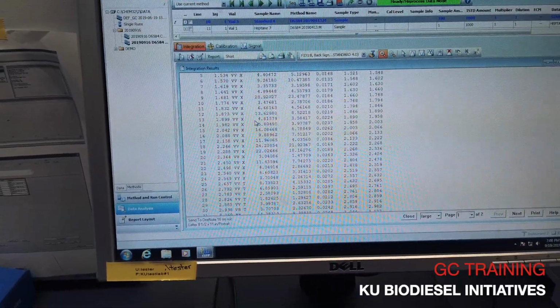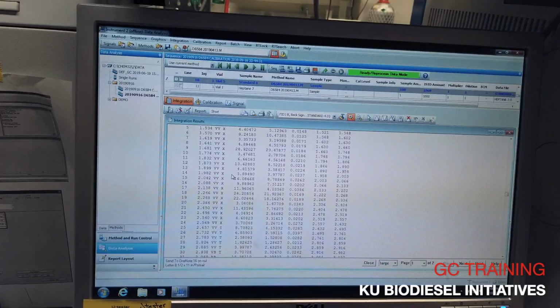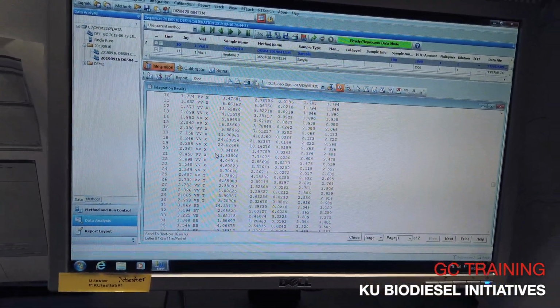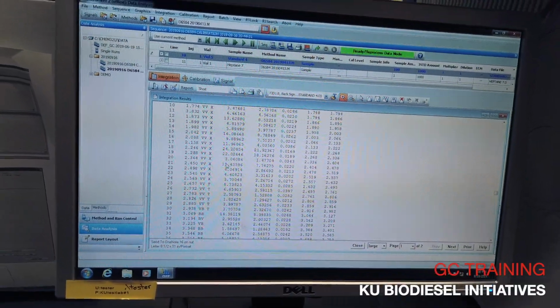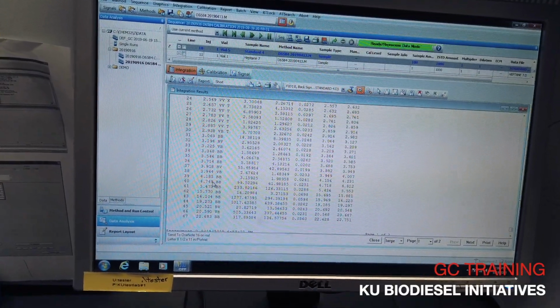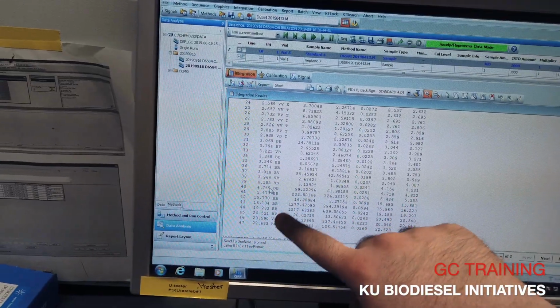So I kind of realized that this might be a lot to do in one sitting. So we might need to split this up. But I'll let you all dictate how, when you hit a saturation point, then we can go from there. What are all the letters there? I'm not sure what the different types mean.